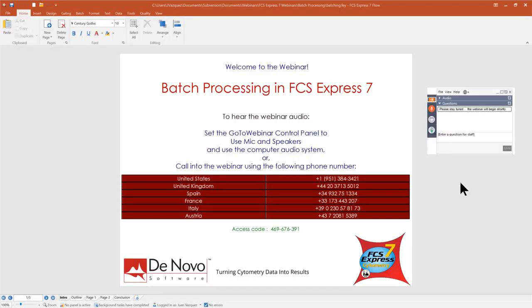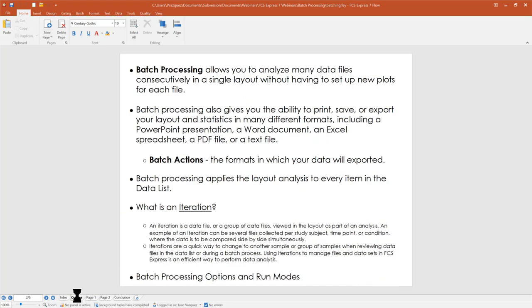Thank you for joining me on today's webinar, Batch Processing in FCS Express 7. Today's webinar is going to focus on our comprehensive batch processing feature — specifically what batch processing is in FCS Express. The overall concept allows you to analyze as many data files as you need to analyze consecutively within a given layout, without having to build new plots, new gates, or a new strategy for each file.